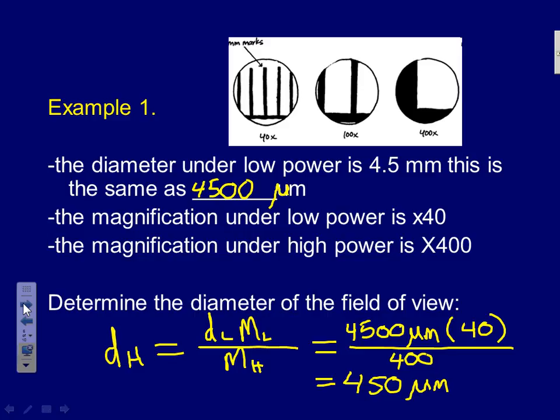Like mew. But that's the Greek letter, and because it's an M in Greek, we use it for micro. I can't use a regular M because that's used for milli. So what the measuring guys invented was that Greek letter, which is mu. It's kind of a goofy letter. So 450 micrometers. So that's how we can do it for each of the different powers.